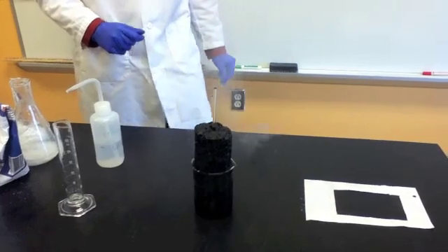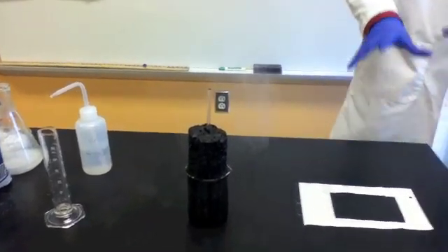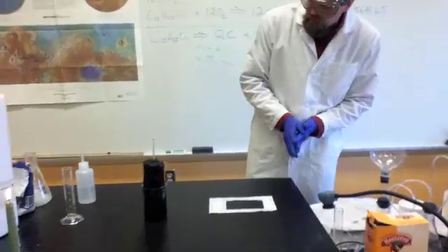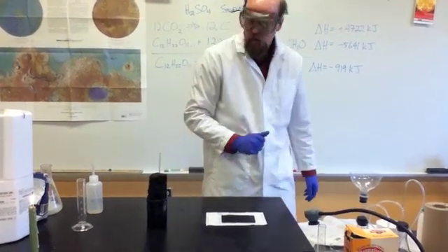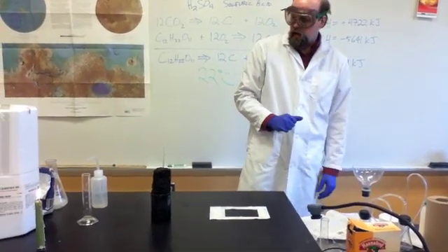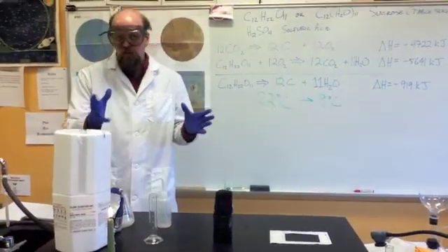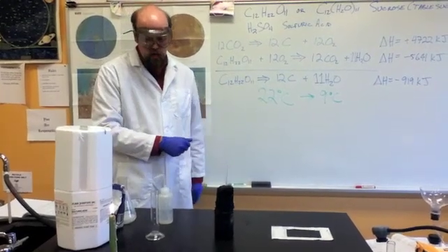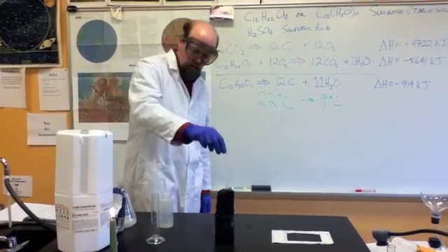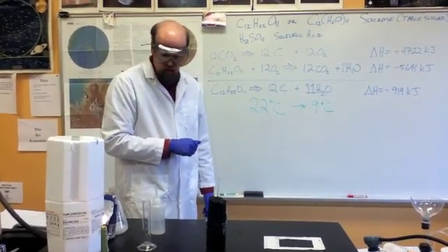What's happening is that the water is being removed and the carbon is being left. This is the same stuff as charcoal or graphite. The bubbles that we see here were, up until a moment ago, completely full of water vapor steam. As that water vapor expanded, it pushed its way out, bursting all of these bubbles. Now we have this honeycomb structure of all these individual places that used to have water vapor in them.